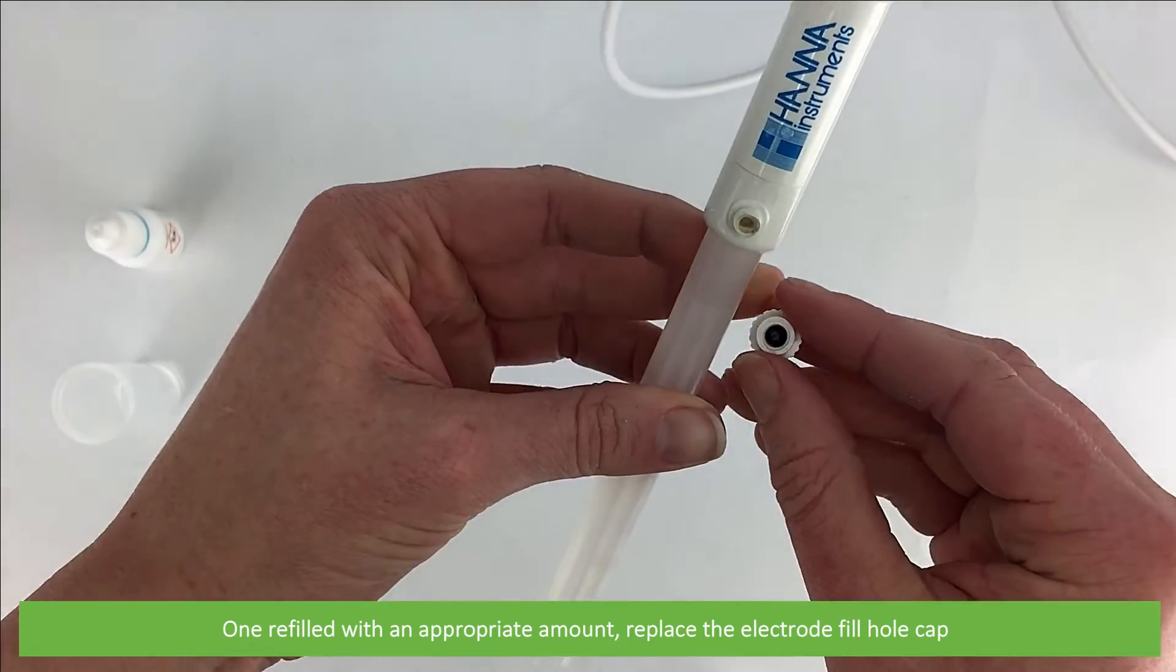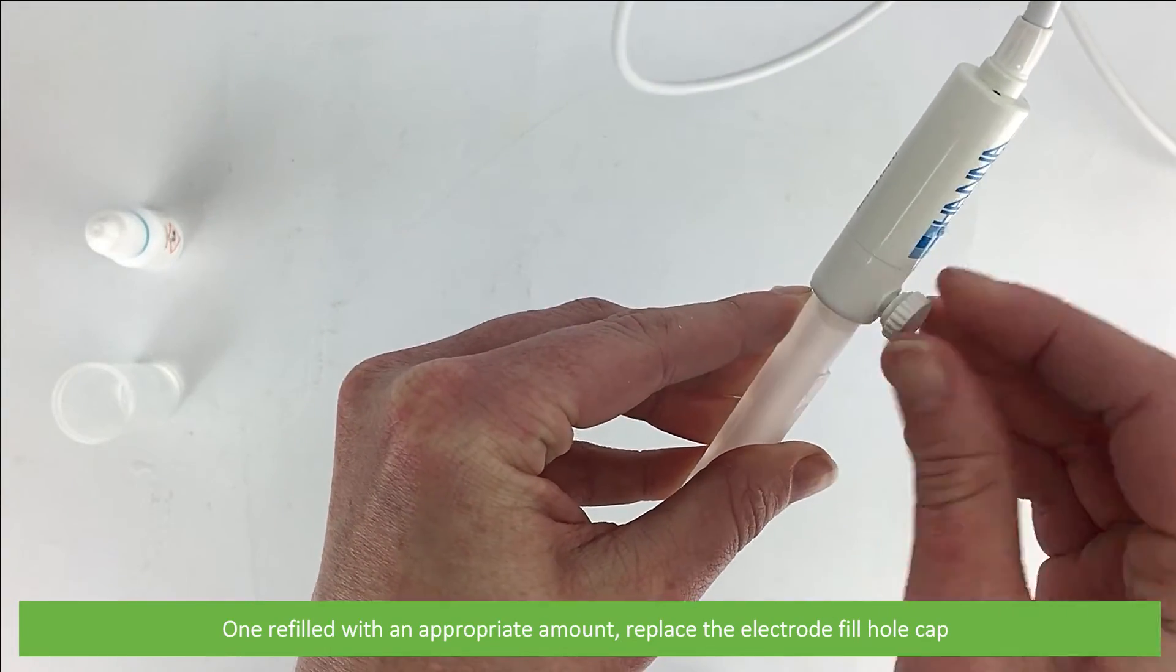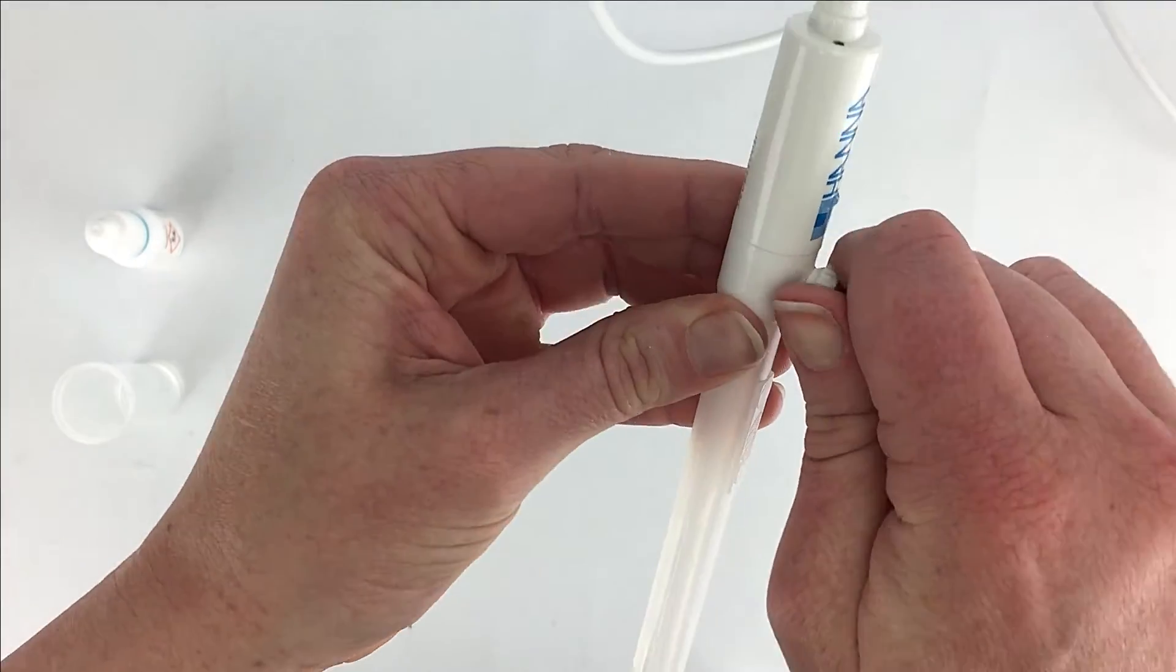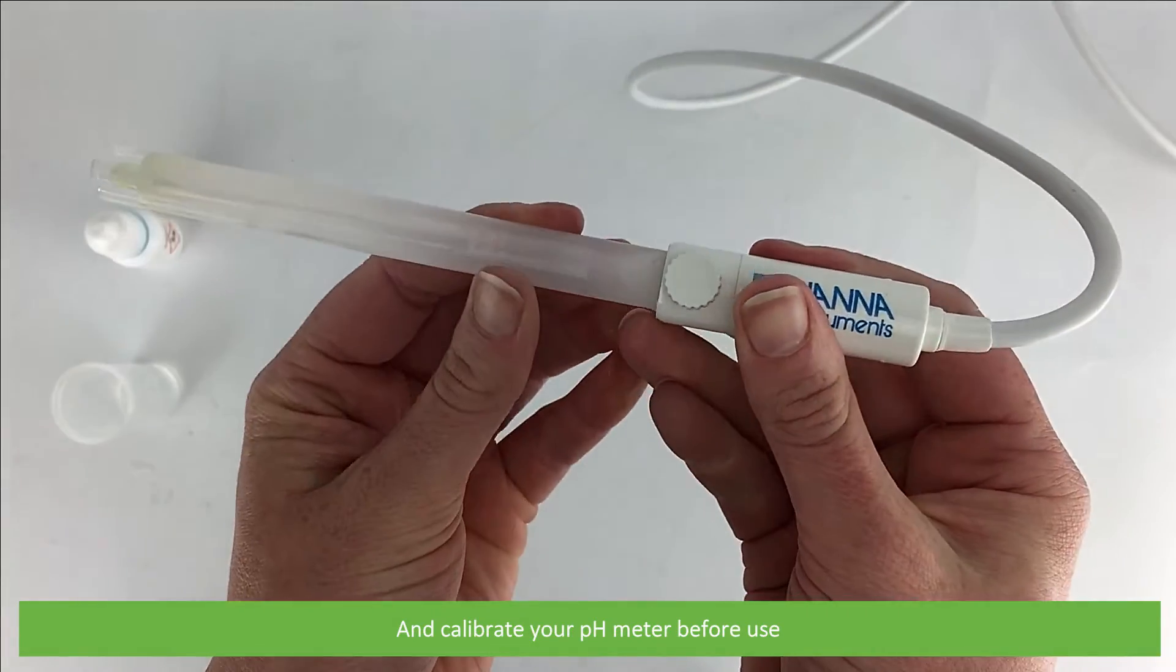Once refilled with the appropriate amount, replace the electrode fill hole cap and calibrate your pH meter before use.